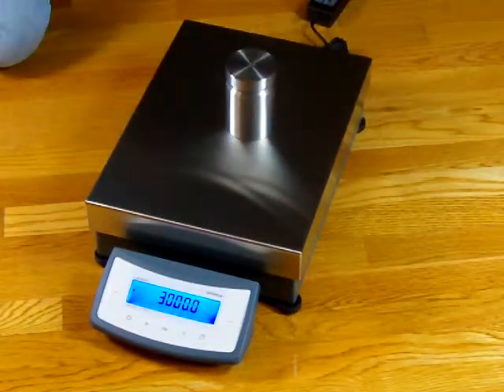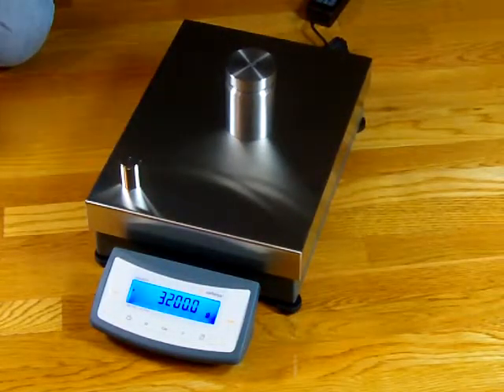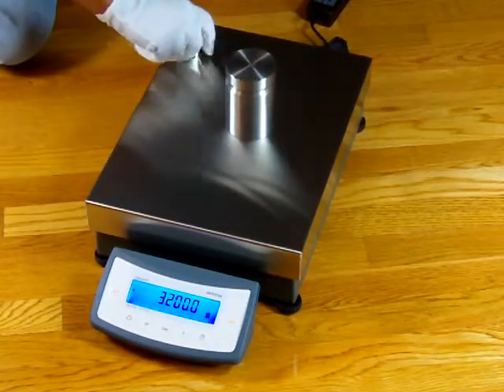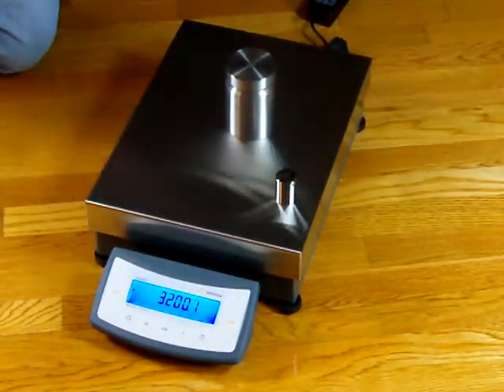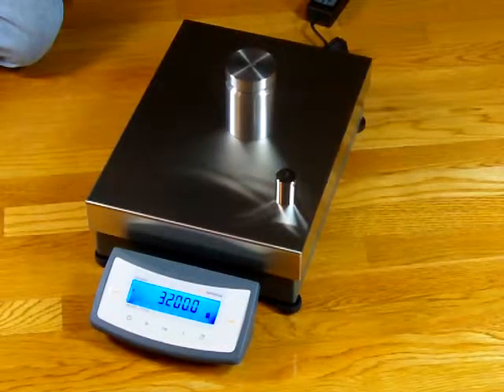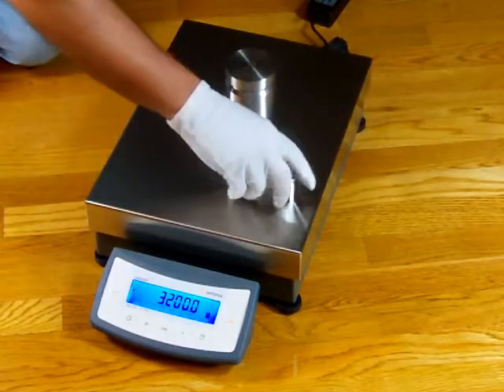It's showing 0.0 here, so there's no difference whatsoever. Calibration is just a simple press of the button, and we can throw on some test weights — that's three kilograms in the center. These are all high quality certified weights. This is 200 grams. There are a lot of scales on the market today and they all claim to have similar specifications, but if you compare other brand balances to a Sartorius the difference is between night and day. Sartorius is unquestionably the leader in the weighing industry for quality laboratory balances.